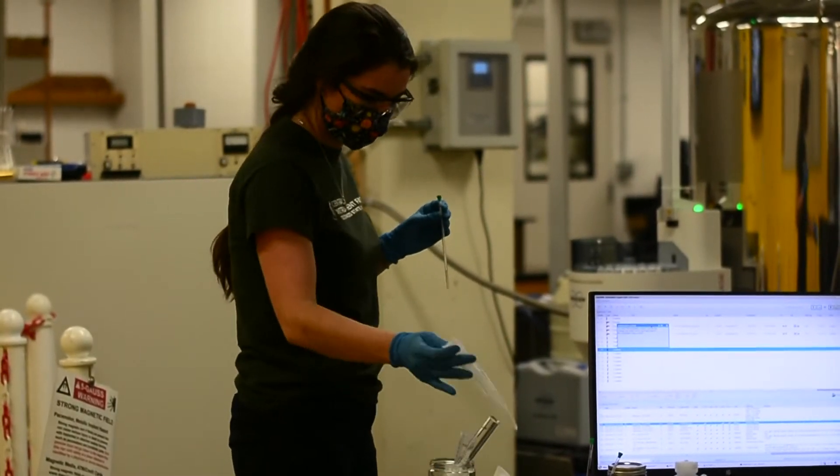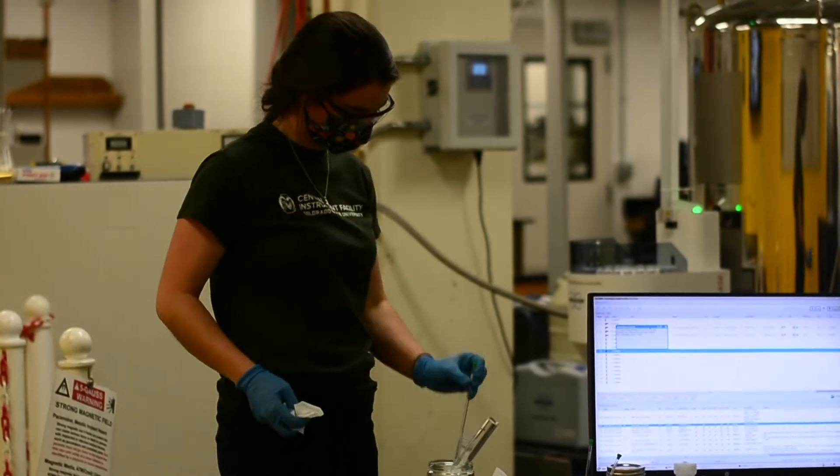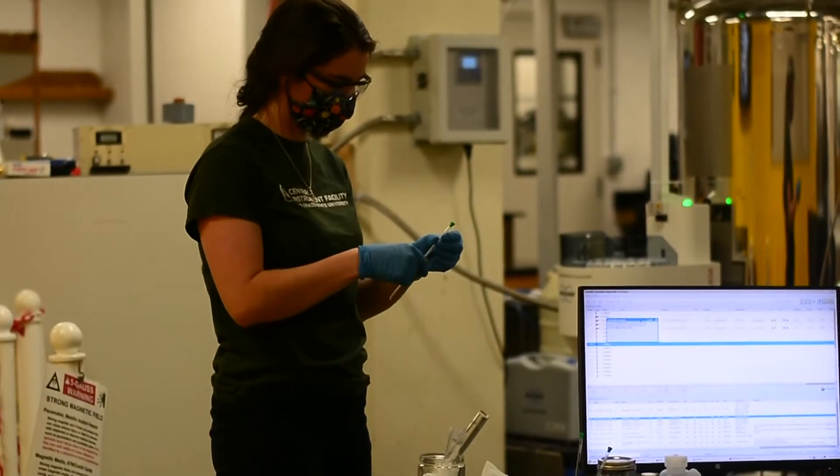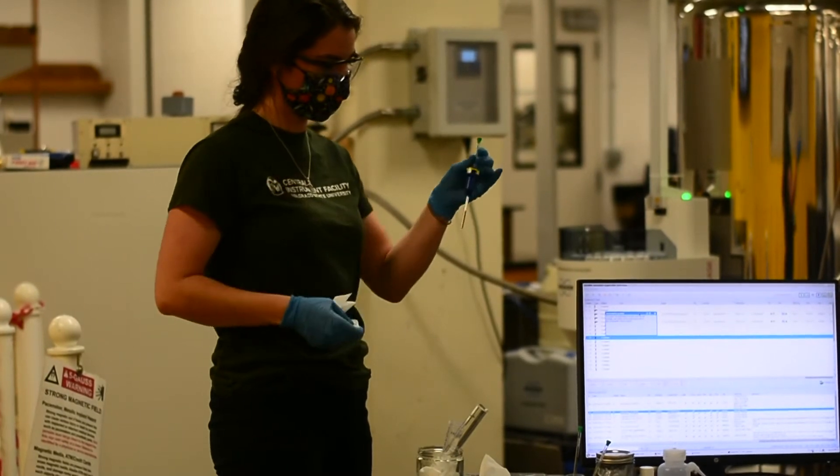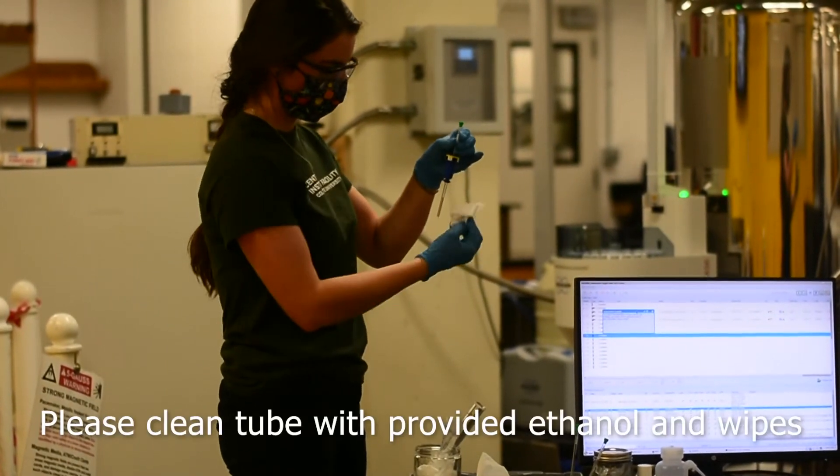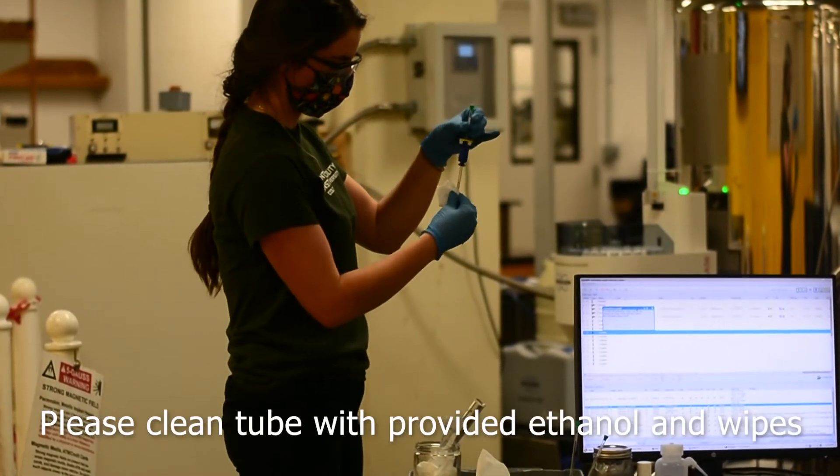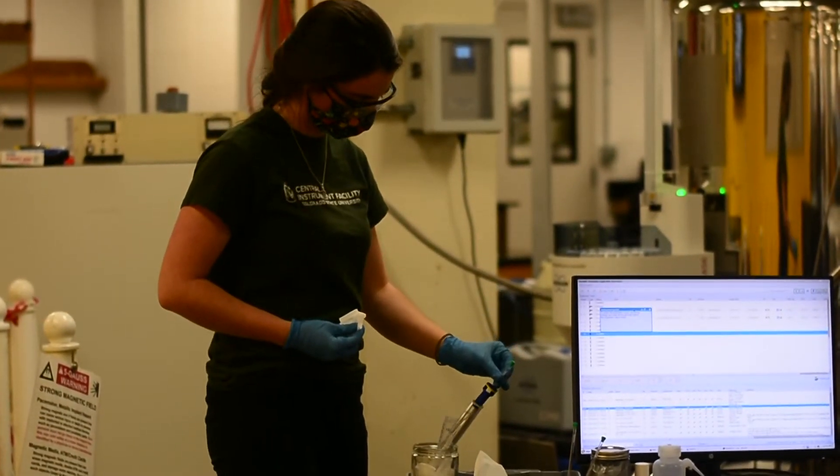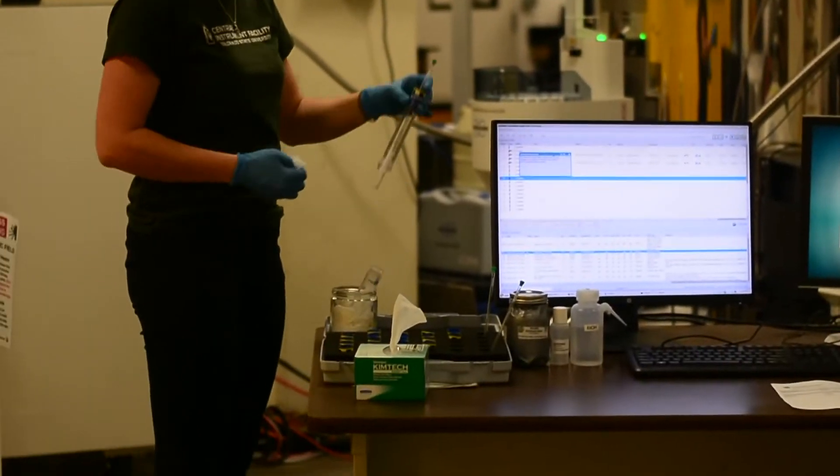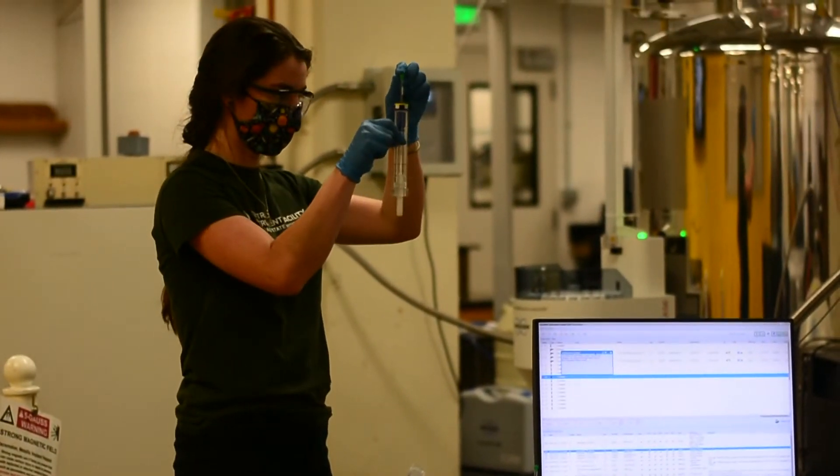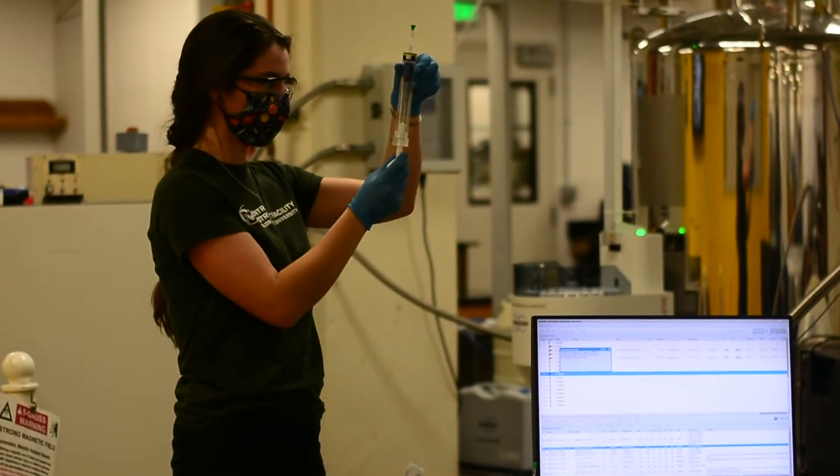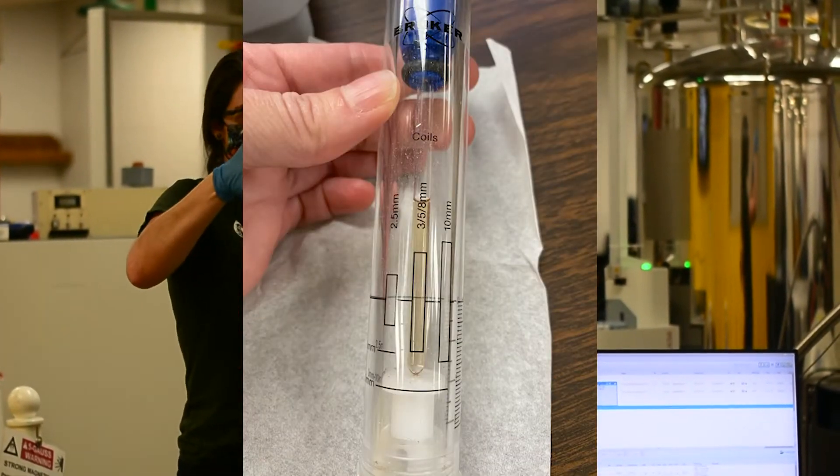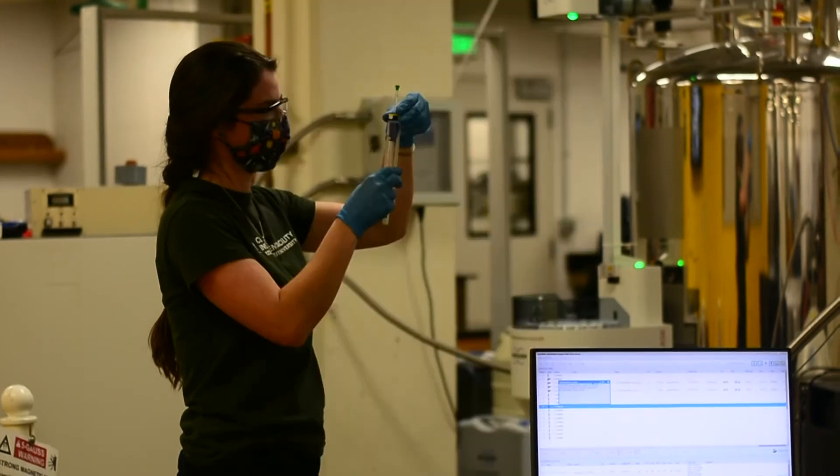Take your NMR sample and load it into a spinner, and then push the spinner far enough up so that you can clean the bottom of the tube. Once you've removed dirt from the tube, gauge it in the sample gauge and make sure that your sample solvent fills entirely the space on the five millimeter line.